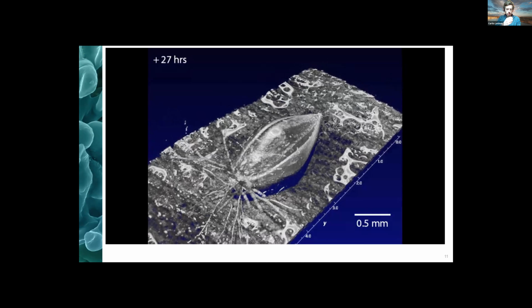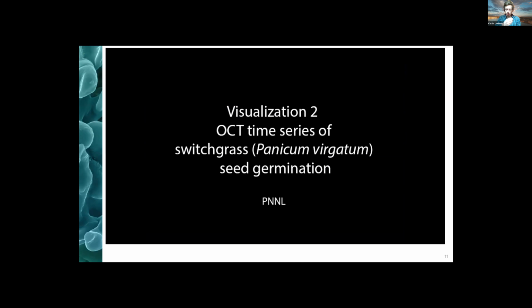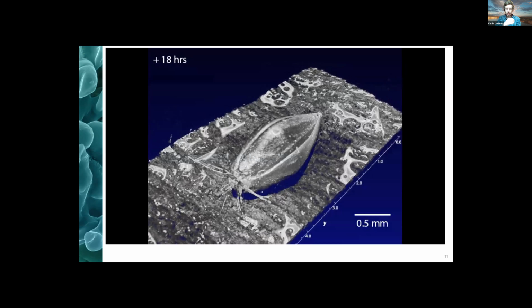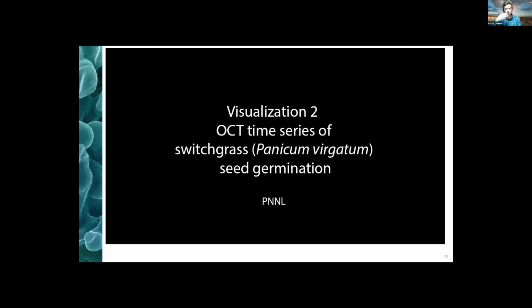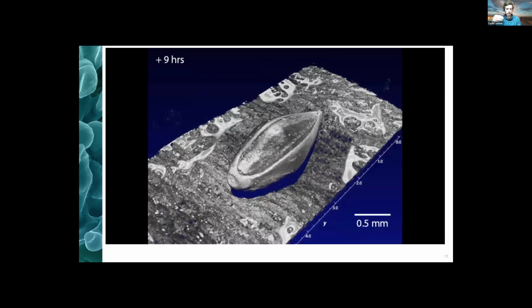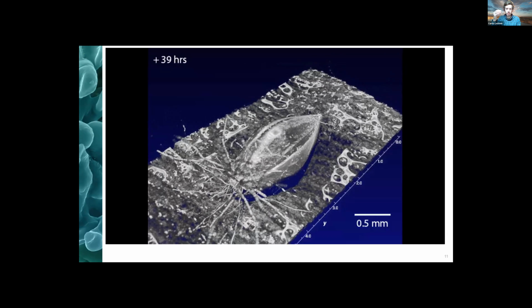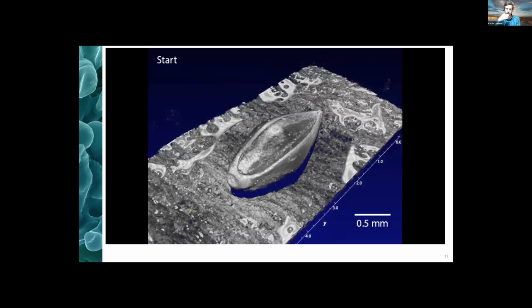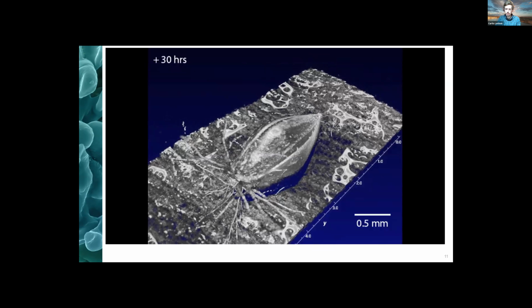He wants to take these really high resolution measurements, and he wants to make a laser ablation spot just at the right time to capture a specific phenomenon. So you can envision using this technique to track the growth of that root until just when it comes into contact with a specific nutrient in the soil, a nutrient island, and then take that measurement right when it gets there, take it as it grows past, and so forth. So that's what we see it as. It's just a nice non-destructive way to monitor for things.